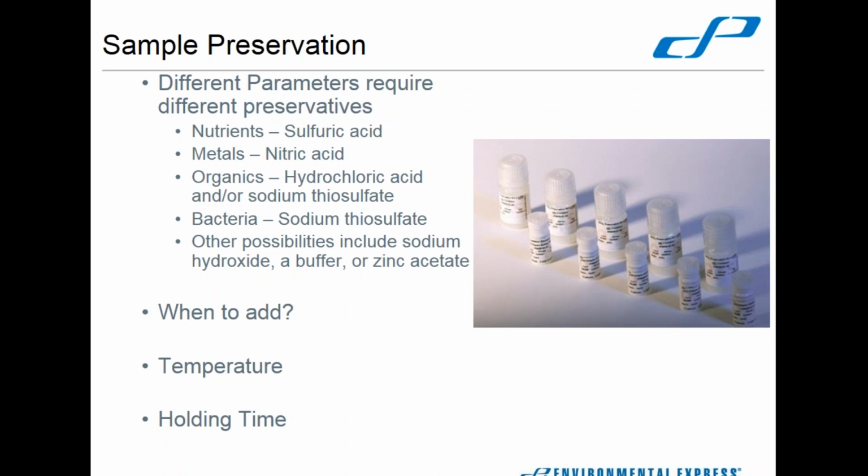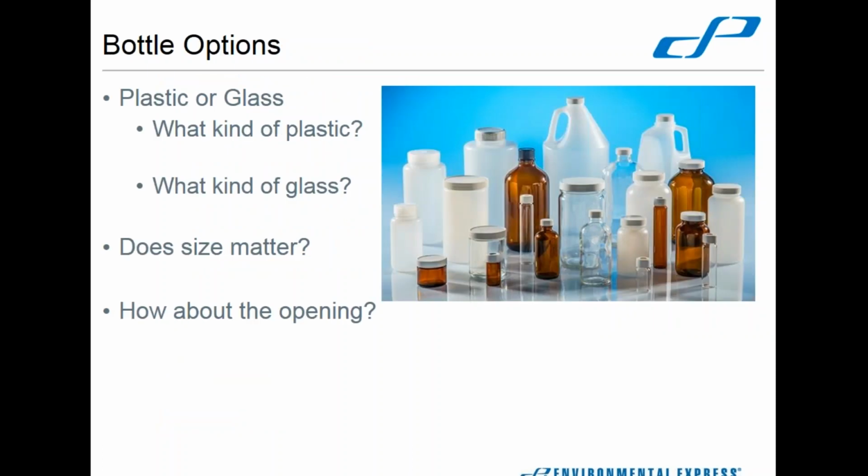And then there are, of course, other short holding times: nitrates, orthophosphate, BOD, those are measured in hours, but that's 48 hours, so you've got about 2 days. So as long as you're getting in the same day, then you're usually okay. But being aware of holding time is important for your sample, especially when getting back to the lab. If you've got any question about stuff, it's always a good idea just to give your facility a heads up on your way in. Say, I've got X sample collected at X time, just so that they can have a heads up on what you're doing.